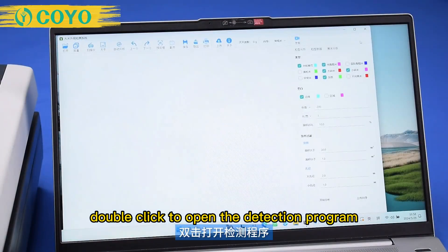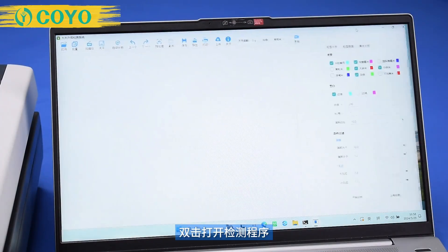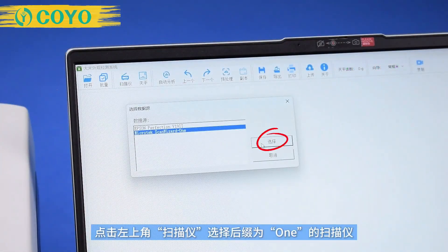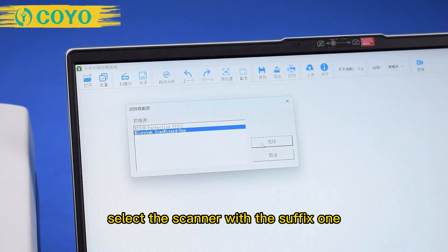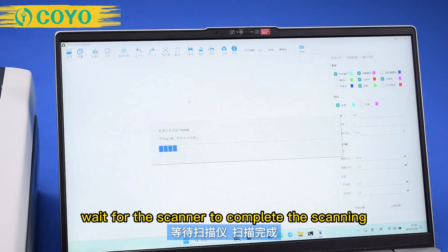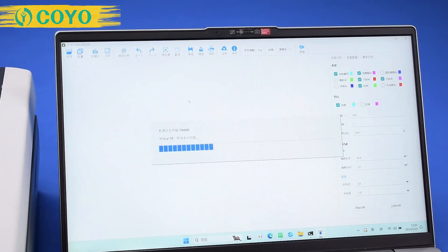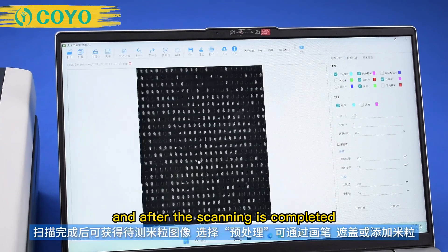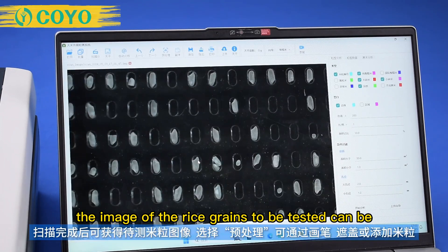Double-click to open the detection program. Click on the scanner in the upper left corner and select the scanner with the suffix 1. Wait for the scanner to complete the scanning. After the scanning is completed, the image of the rice grains to be tested can be obtained.